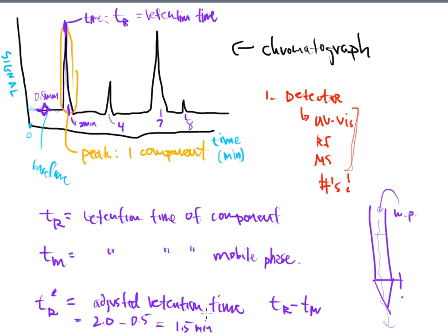Now, why would we do this? The reason that we would do adjusted retention time is because different labs can use different columns that have different lengths.